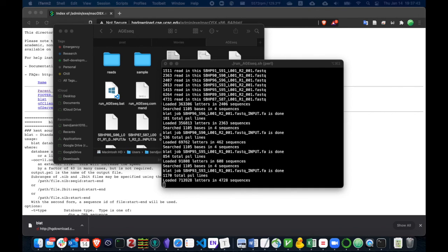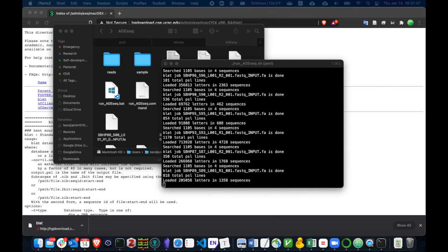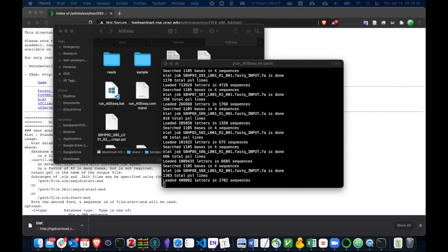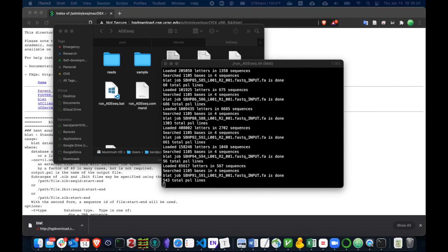To sum up, these steps should be enough to let you run AGEseq on Apple machines, that is using Intel CPU. We do not have access to the new products that use M1 chips, so we are not sure about what will happen on those machines. However, we are planning to update the AGEseq, making it more powerful and user-friendly.